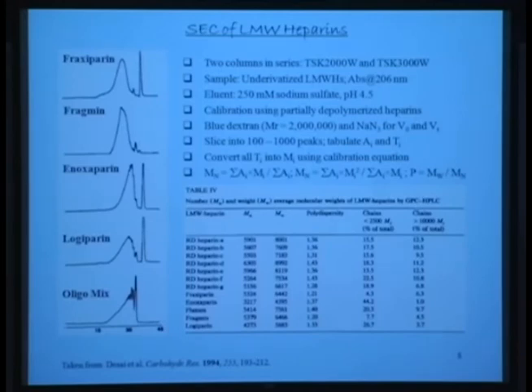And you can see that, and these are obtained through different techniques. And the idea behind this paper was that each low molecular weight heparin is considerably different. And you might think that this is the same as this, you can probably find there is a difference here, as well as these two are probably similar. But if you really look at number average molecular weight and weight average molecular weight, and chain compositions, then you end up with significant differences across the board.